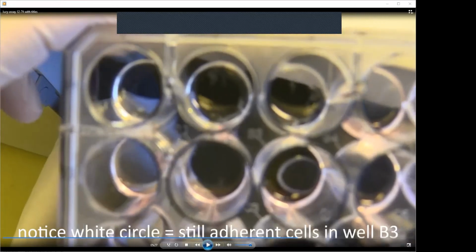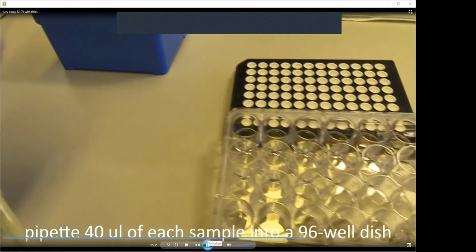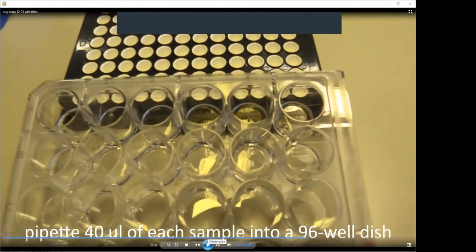So you have to always be careful and check this situation, because if you are mainly working with a new type of cells, it can be dangerous if you are not properly lysing them. Then we have used 100 microliters for the lysis, and you remove 40 microliters of each sample and put it into the 96 well dish.